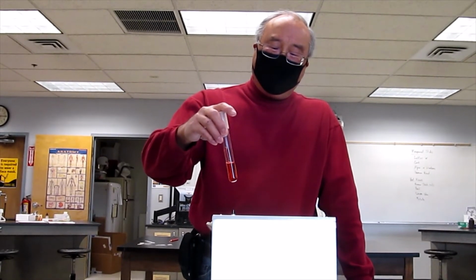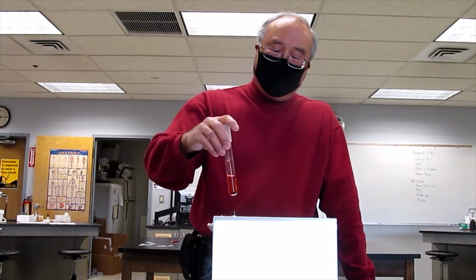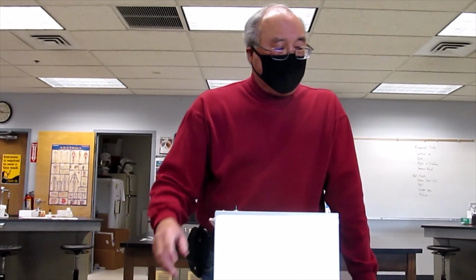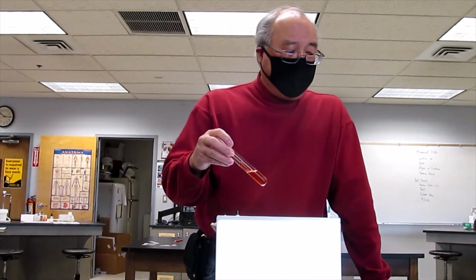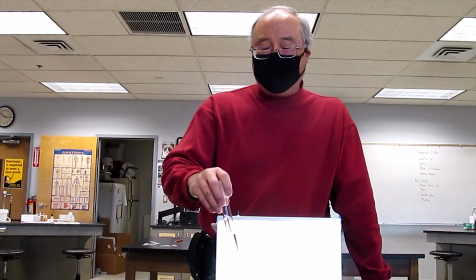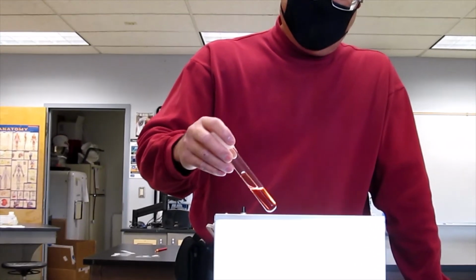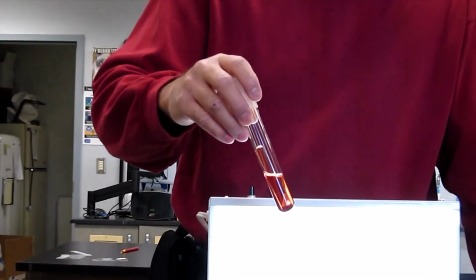We have lactose in this particular media, but you can have many other different types of sugars present and determine whether or not your bacteria can metabolize that sugar. Other contents that you'll see inside this media is that you have a reddish tinge to it, and that's because inside the media is a pH indicator, phenol red. And it'll be an indication of whether the fermentation of the sugar that you also have in here results in a change in the pH of the media, you'll see a color change.